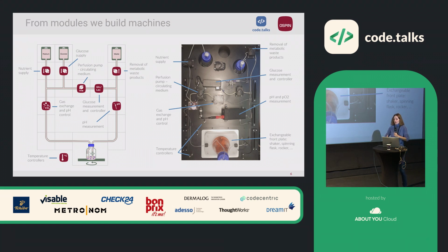But of course you are right. If you go more in an industrial way, where you exactly know what you want, then what you are saying is relevant. It's funny, because we are working on a proposal for a project, and it was exactly this question: we need so many tubings, and we need to find a way to have it already prepared and minimize the time somebody has to take to put the tubings on the machine. So your question is definitely relevant. It's something we have to solve, but more for a later stage and not for research, which is what we are mainly doing right now.